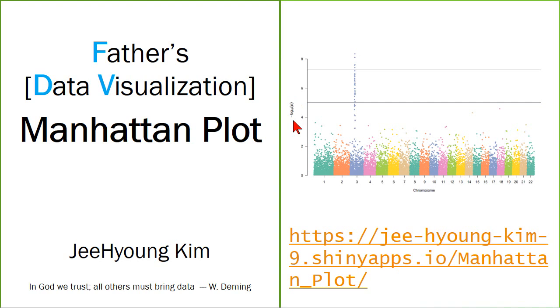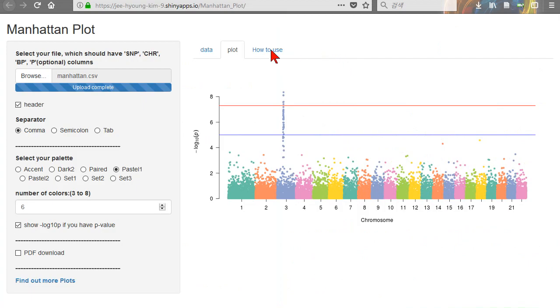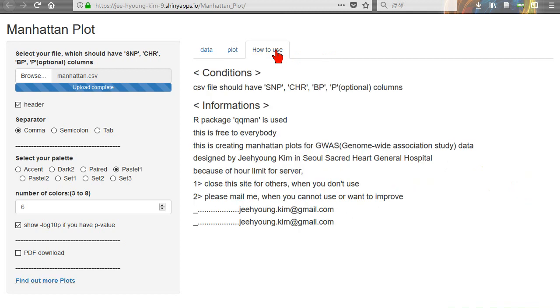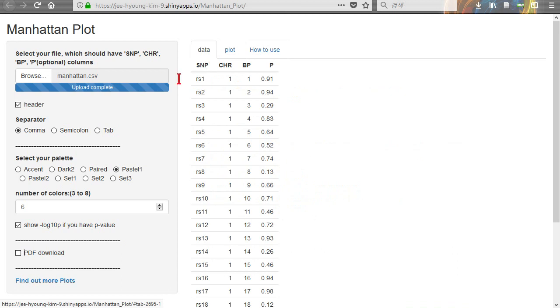Let me show you how to make it. Before we start, let me show you how to use GWAS — Genome-Wide Association Study. If you are not studying this kind of study, you cannot understand what it means. Upload the data file: Manhattan.csv, which has the fields SNP, CHR, BP, and P.